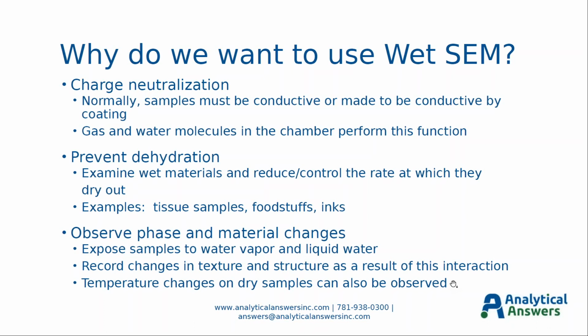Just a side note, you don't always have to involve water. The temperature controlled stage can be used on dry samples, and of course you can just look at deformation of materials as a function of temperature changes over the range that we can obtain. And by doing so, just look at how polymers or organic matter changes as a function of temperature and time on a very micro scale.